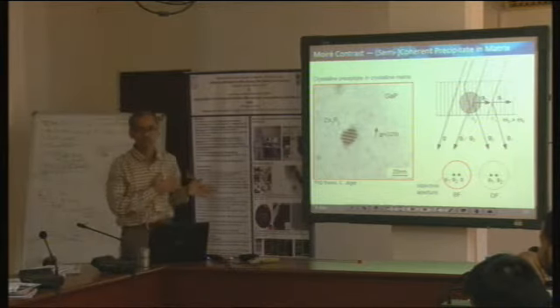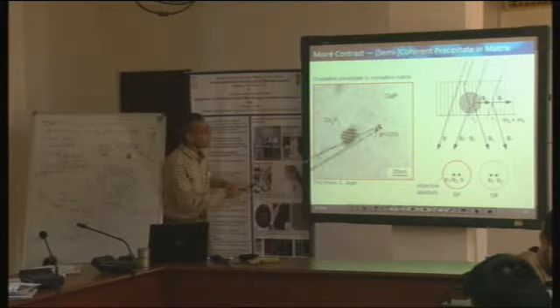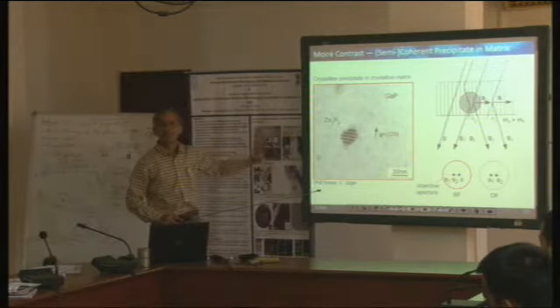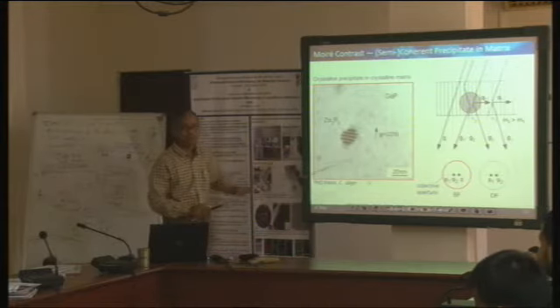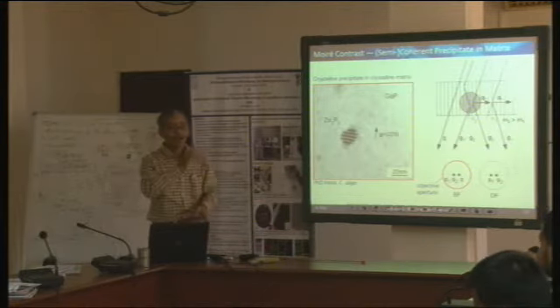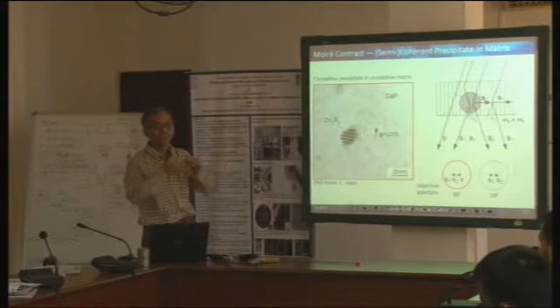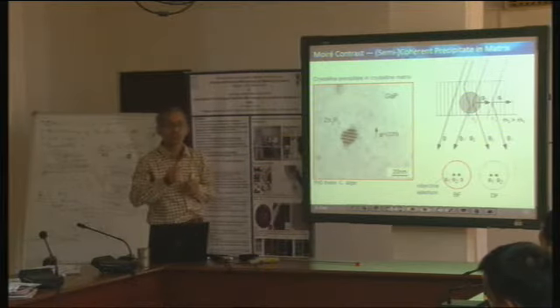Now, this is an opportunity to do that. Whether it is bright field or dark field, this image was acquired under two beam conditions, wherein this G220, that is the 220 reflection, was strongly excited apart from the zero reflection.